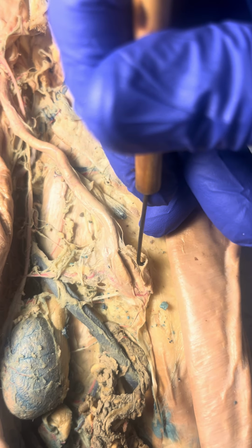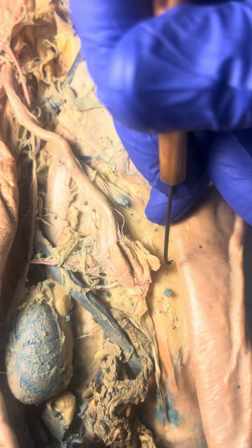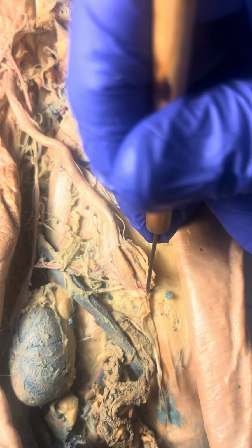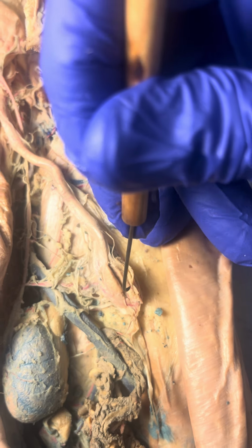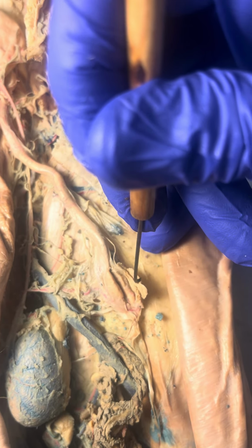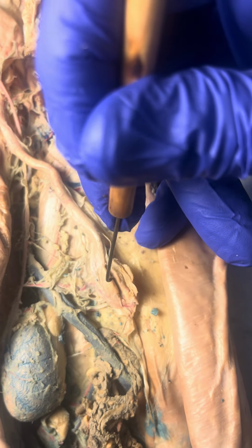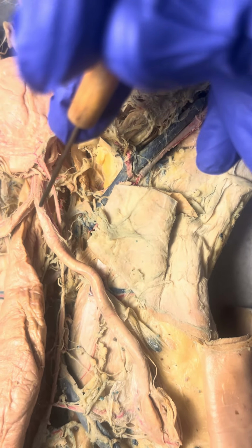Right, I would say that little tube, there we go. That little white tube is the fallopian tube, and the ovary is here. Maybe this little white circle, or maybe this. So the ovaries are very small, the fallopian tube is quite small, and the uterine horn is really large.